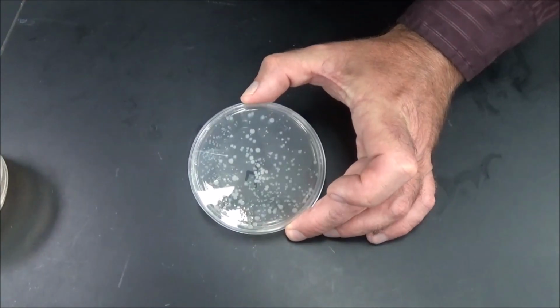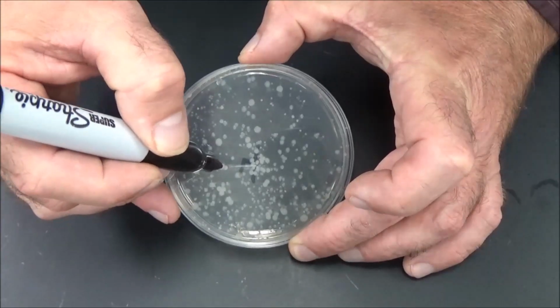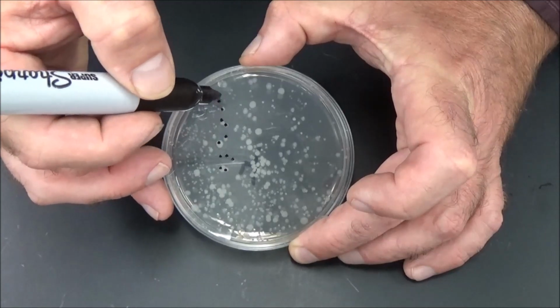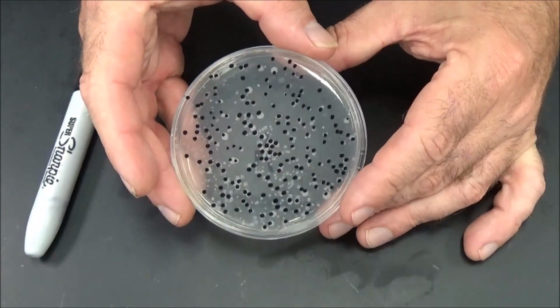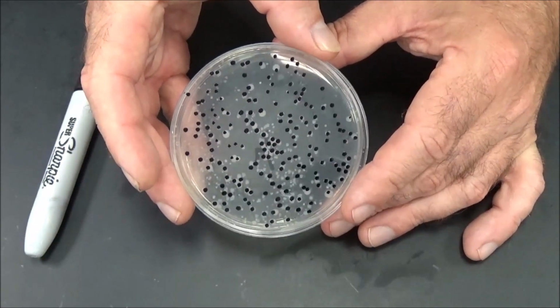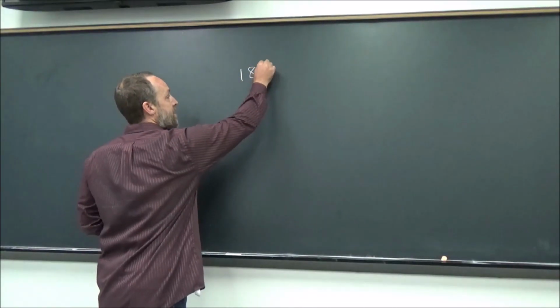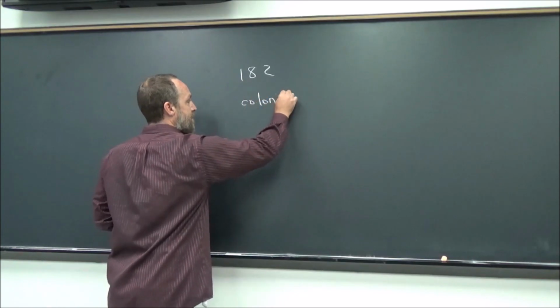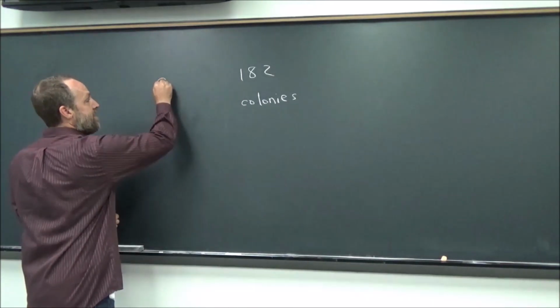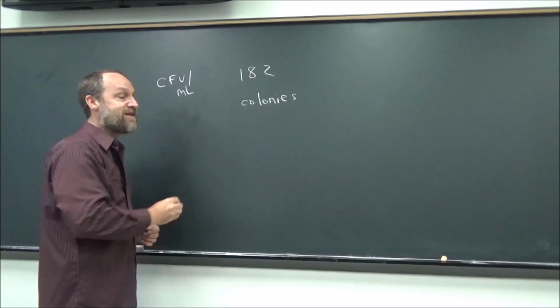Let me zoom in. Okay, this is going to take a few minutes, but I'm going to put a black dot everywhere there's a colony. 1, 2, 3, 4, 5. Okay, I counted 182 colonies. So how do we use that information to back calculate the original concentration of bacteria? Okay, we had 182 colonies. And what we're trying to do is determine the colony forming units, CFU, per milliliter of the original bacterial sample.